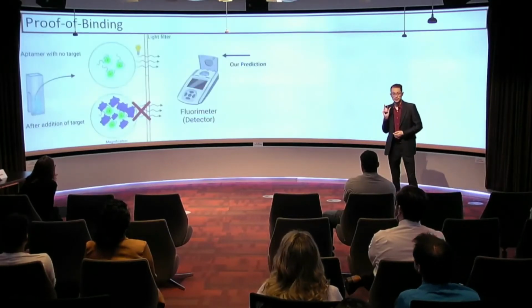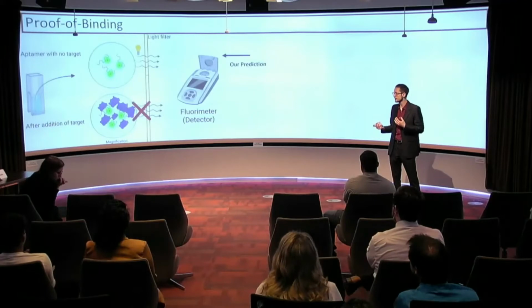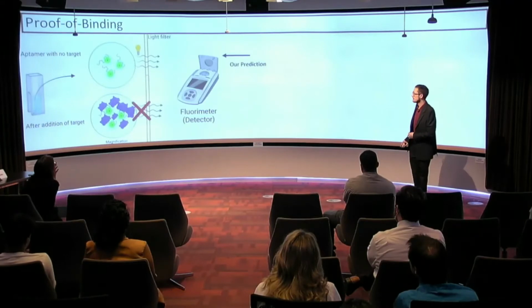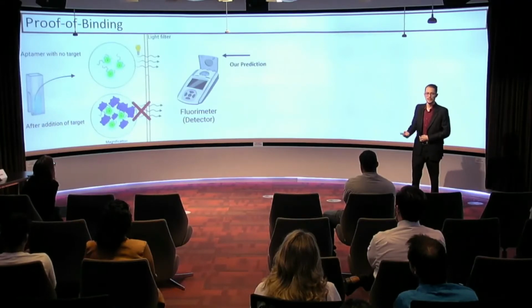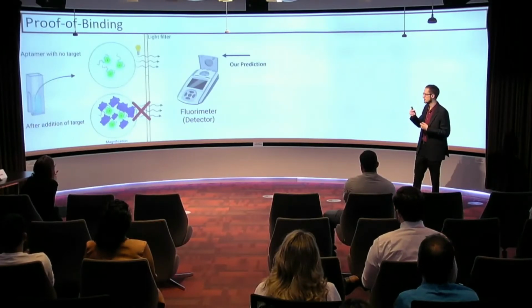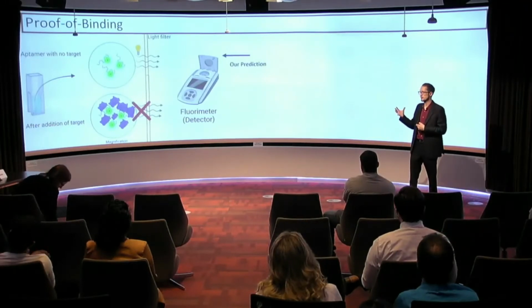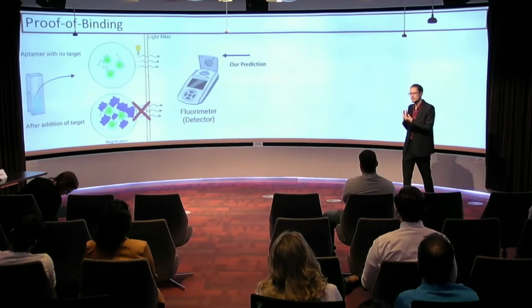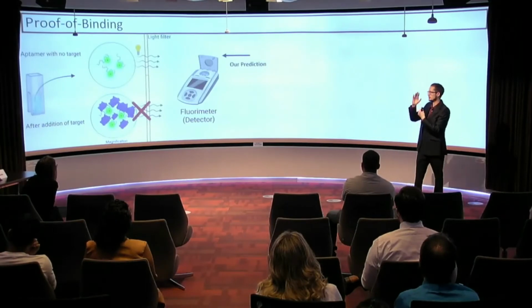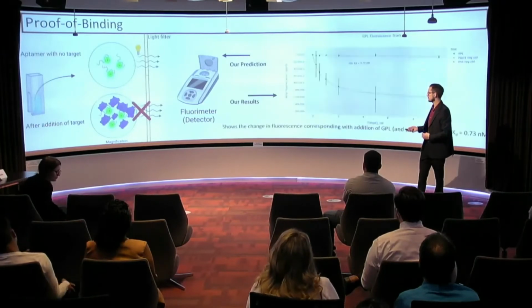So now that we have that DNA sequence, we kind of know how it's going to look in 3 dimensions. We can determine if it actually binds to GPL as we assumed it does. To do this, we use a technique called fluorescence spectroscopy, and we attached fluorescein molecules onto that DNA. And fluorescein emits fluorescence that goes on to hit a detector called a fluorimeter. And our theory was, if GPL is binding with high affinity, those GPL molecules are going to form a wall around the DNA and surround it, and the GPL will absorb that fluorescence, causing a decrease in the fluorescence. And that's exactly what we saw.